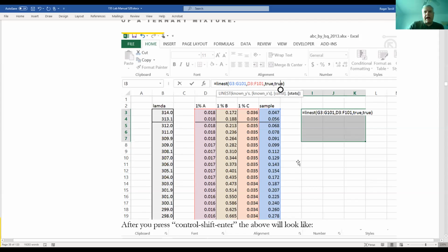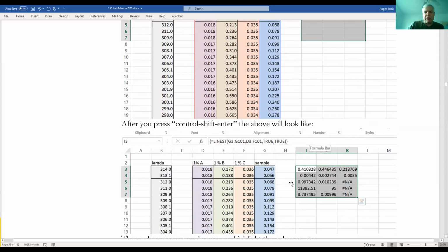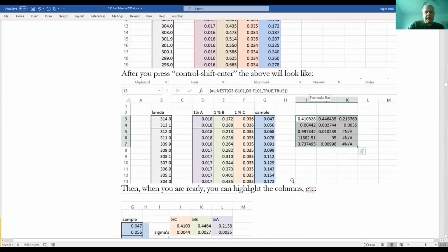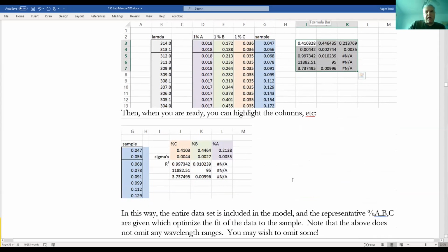And the only thing that I want you to take care of when you do this last approach is if you can remember to not include noise or distorted data. And I'm going to show you what I mean here.